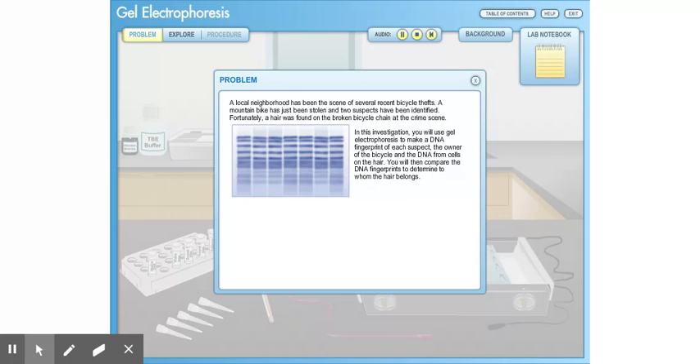In this investigation, you will use gel electrophoresis to make a DNA fingerprint of each suspect, the owner of the bicycle, and the DNA from cells on the hair. You will then compare the DNA fingerprints to determine to whom the hair belongs.